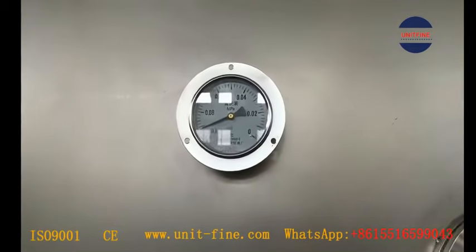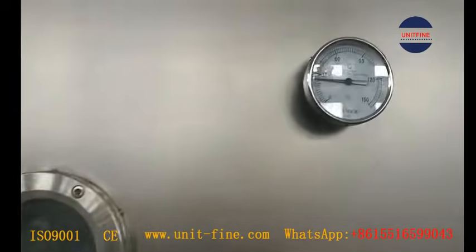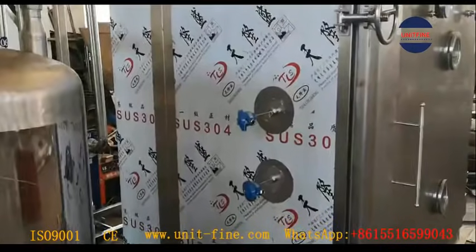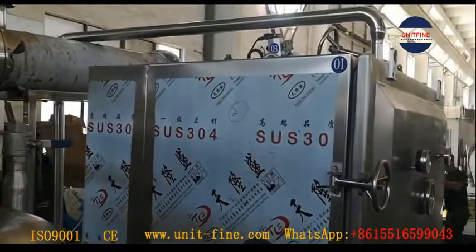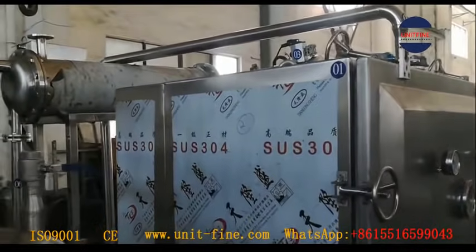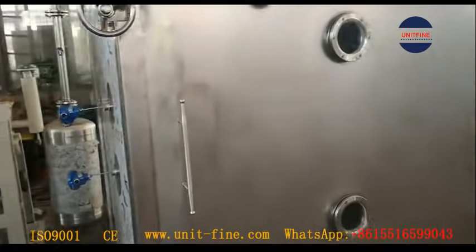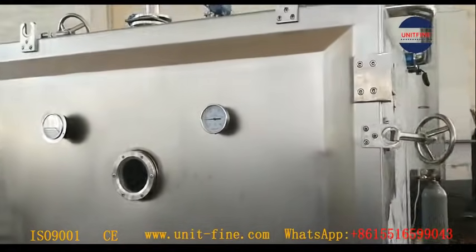The two vacuum tray dryers are a wall integration structure. The doors and control cabin would be in the clean room, while other parts such as the two condensers, the heat exchanger, the vacuum pump set, and related pipes and tanks under the drainage pipes, would be in the equipment room to comply with the GMP standard.